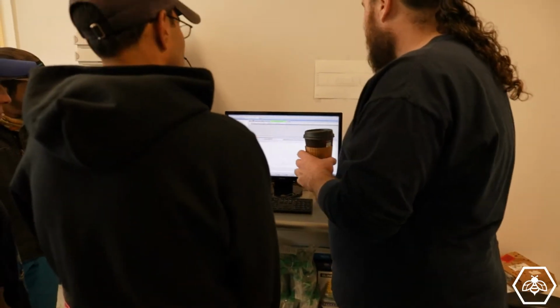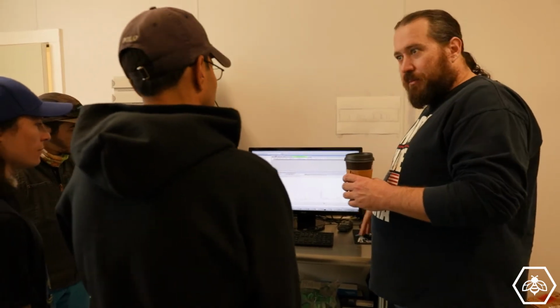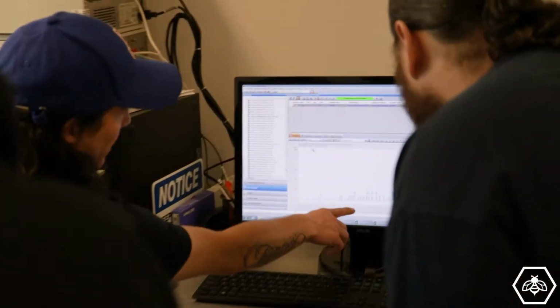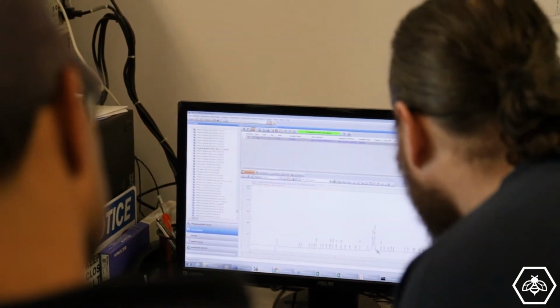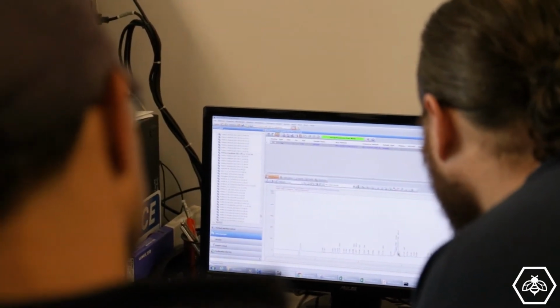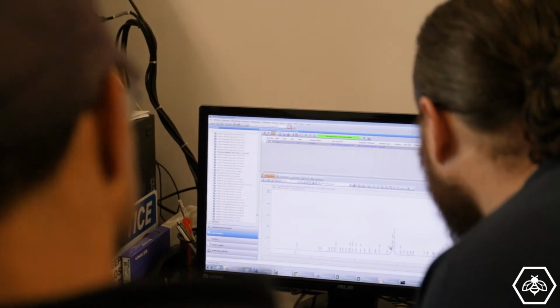And then you can see we overshot a little bit because we came in here and we're doing our test. We're like, oh shit, we need to go stop it. So we stopped. All your CBD is gone. Yeah, all the CBD is gone. We probably got about a 1 to 2 ratio of CBD to Delta 9.